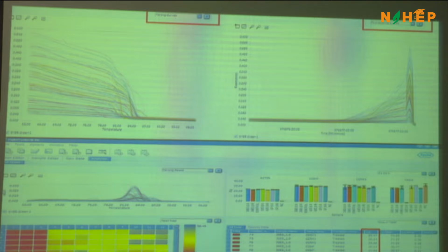The next one, the lower part, is what you need for analysis. It is in a tabular format, and you are going to convert it into Excel. Every machine has its own software. This is from Roche, LightCycler 96. But the thing you need is the CQ values, and every instrument will give you that. You just take it, convert it into Excel format for your own quantification and analysis, and then you're done.